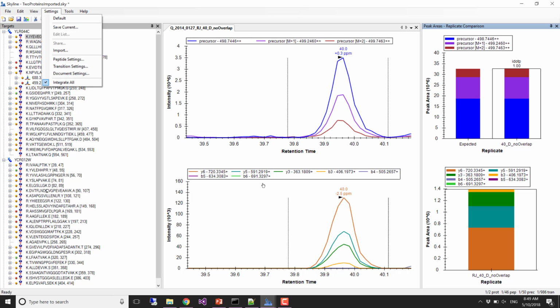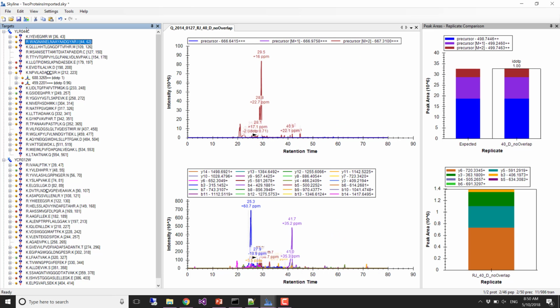Yeah, they're not very selective, and especially if you think about those highly chimeric DIA spectra, that's not a lot of evidence. It's not giving me a whole lot more evidence than my precursor. But yeah, my precursor looks great, right? So this is a really nice spectrum. Skyline just chose this out of the blue, and we might definitely go, okay, I feel like I measured my protein here with this peptide.